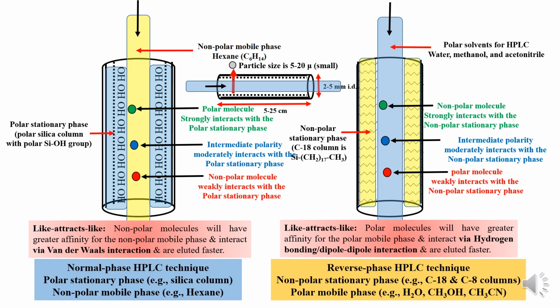And it's also called high pressure liquid chromatography because there is pressurized flow of the mobile phase. The components of the sample mixture travel at varying speeds inside the column along with the mobile phase. The speed at which they travel depends on their relative affinity towards the stationary phase. And therefore the operating pressure is around 1000 to 8000 psi.